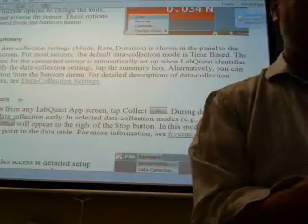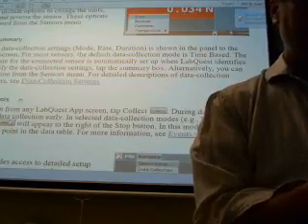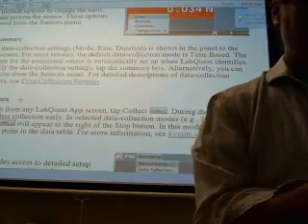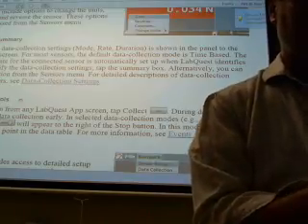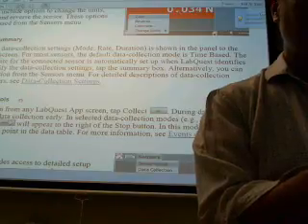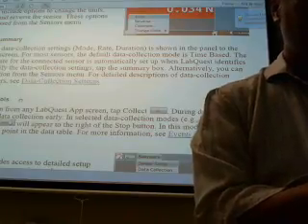So what we're going to do is just enter it in. If we could divide, that would be the easiest. Or can we change the sample? I changed it to minutes. Okay, I put 60 seconds, every 60 seconds. What's the interval, for the duration or the interval?